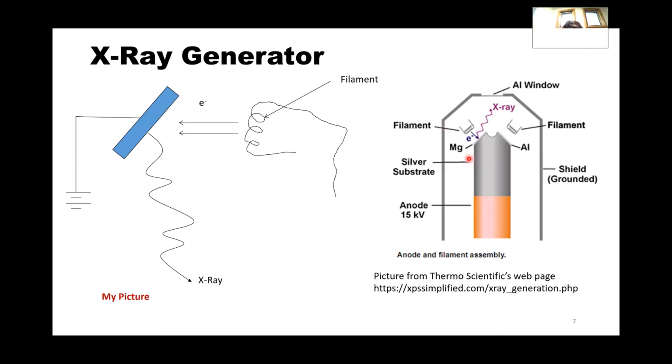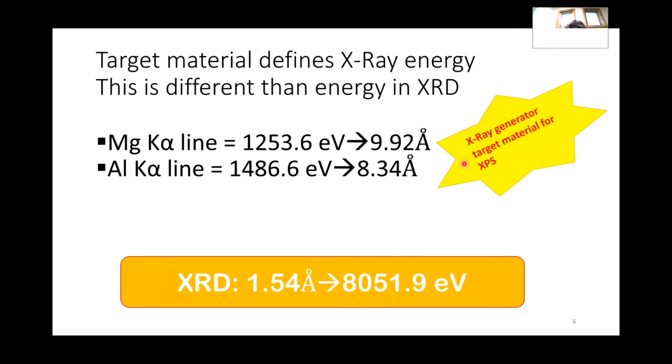So here, this is depicting a dual wavelength gun, basically. So you have two distinct wavelengths. Why would you need two distinct wavelengths? Why do you think that? If we go back here, we actually have two different energies, and they're not all that different, but they're just different enough. And you'll see on the subsequent slides what we're actually doing with the X-rays.